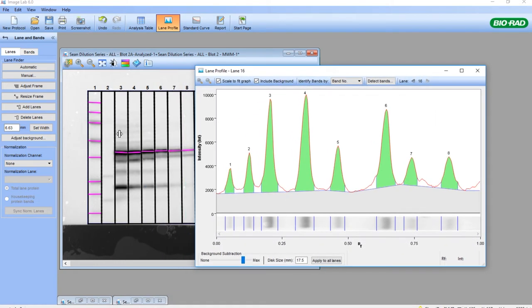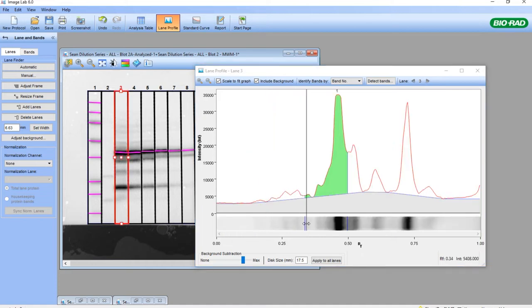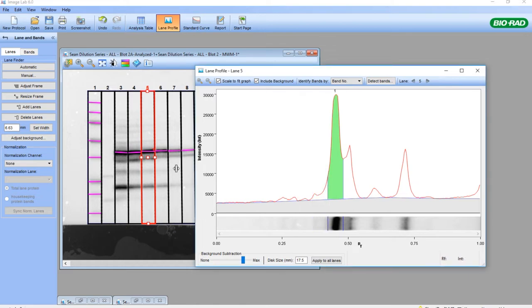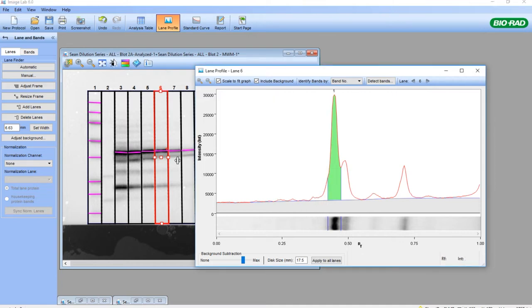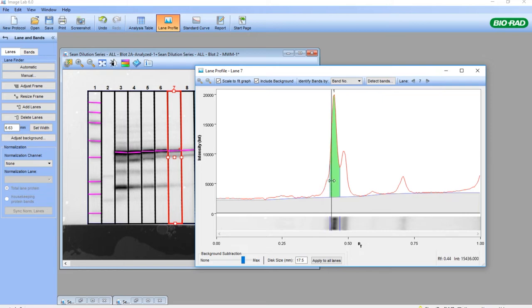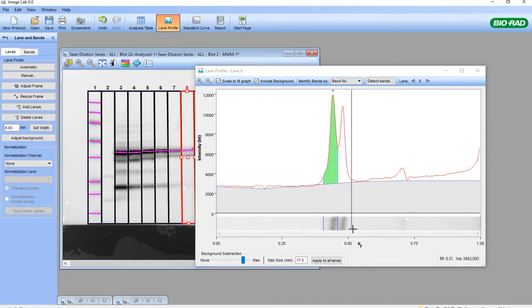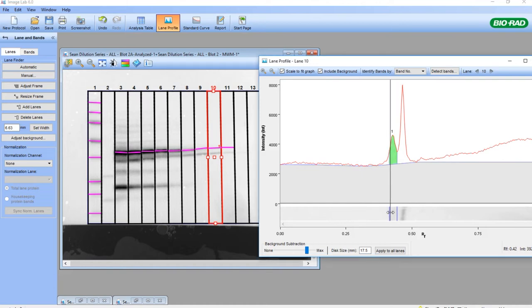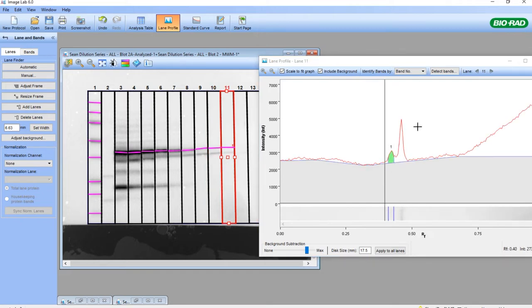I'm now going to look at each lane individually to make sure my band of interest is selected properly. This band is not quite right, so I want to be right in the middle of that peak. Lane by lane, I'm going to use the lane profile tool to help guide me in assuring that the bandwidth is appropriately selected by the associated peak, which I'm coloring in by using these blue bars. This permits very accurate densitometric analysis as well. If you watch the densitometric analysis module, I perform a very similar assessment of each peak before doing the densitometry.